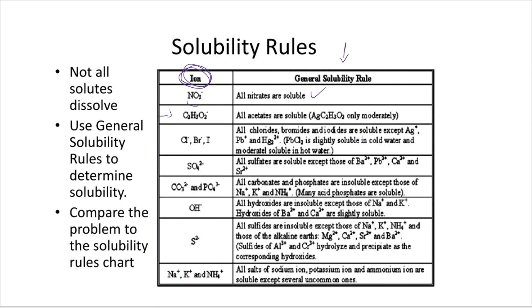So, here's maybe my first encounter of gravimetric analysis. Let's say that I have a solution, and this solution is made up of stuff, but one of those things is silver. Silver, free, swimming around in the flask, having a grand old time all by himself. It's a bachelor kind of life. Well, I want to pull that silver out of solution. I want the silver to go.